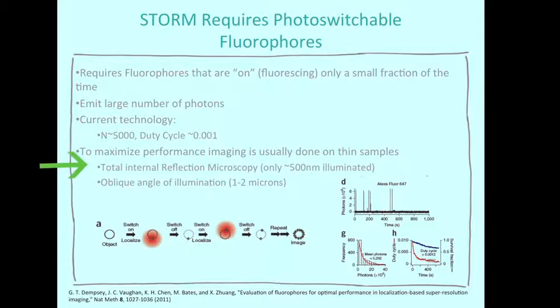To maximize performance, this type of imaging is usually done on very thin samples. To make a thin sample, a lot of the techniques were, at least initially, done with total internal reflectance microscopy.